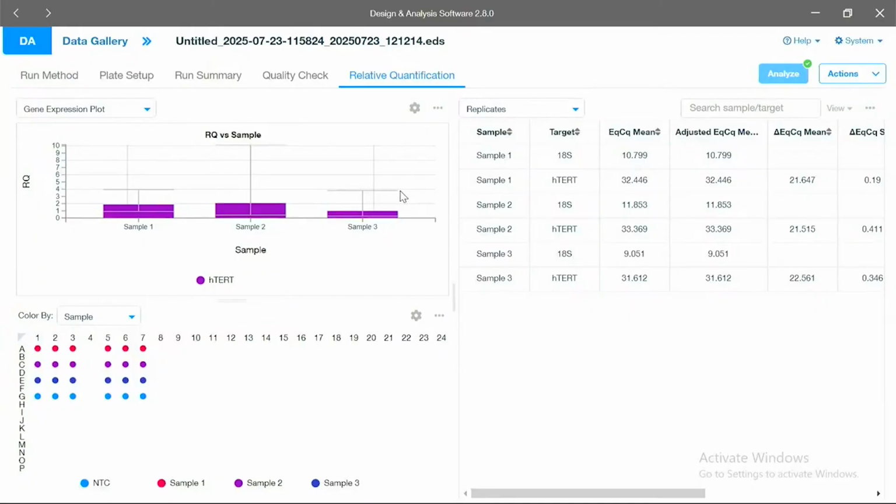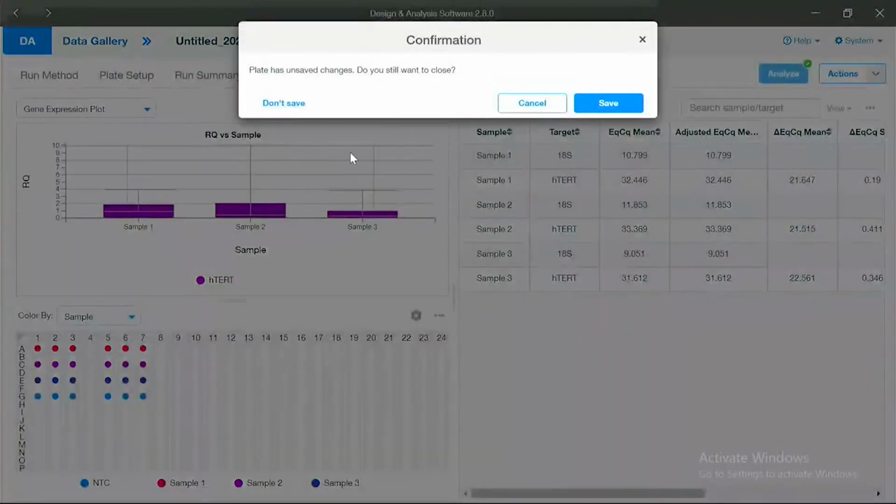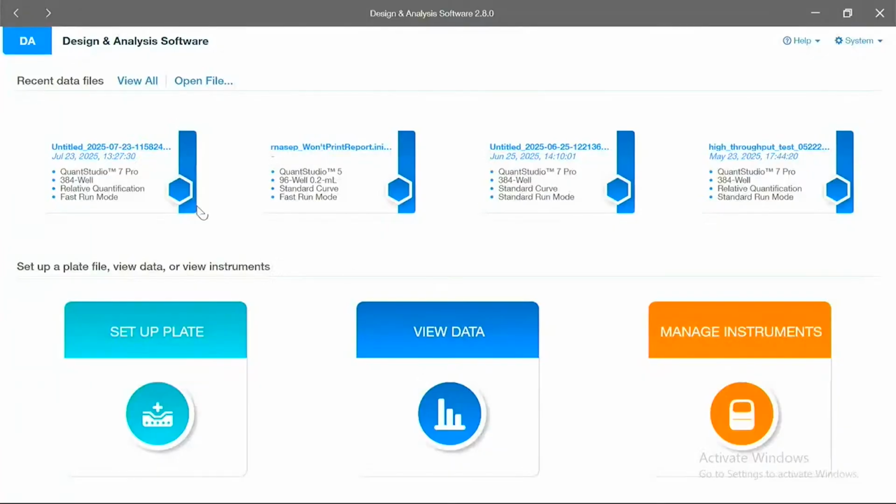There is no change in the relative expression of these samples because we're comparing what's going on inside the sample and not the quantity of the sample. We changed the total quantity we put in, but the relative change is the same between the two genes that we're looking at. Okay. This is a little easier to understand, so I'm going to open an example file. I think that'll be easier to understand because there will be variation. So let's open.